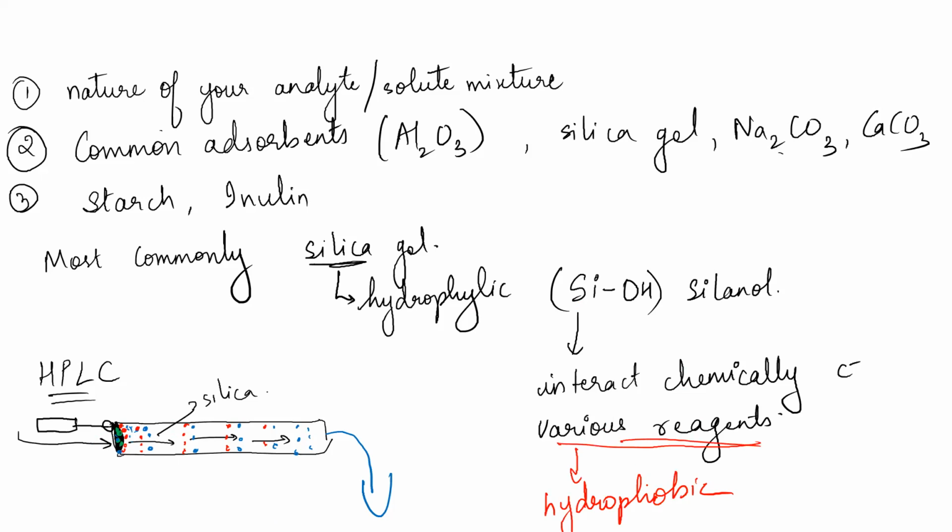Now, why am I telling you all this? Because HPLC is also used in separation of important bacterial and fungal intermediates. It is also used in separation of biomolecules, proteins. A lot of things are separated. Drugs, in pharmaceuticals, HPLC has a lot of significance. So that's why I'm telling you this.